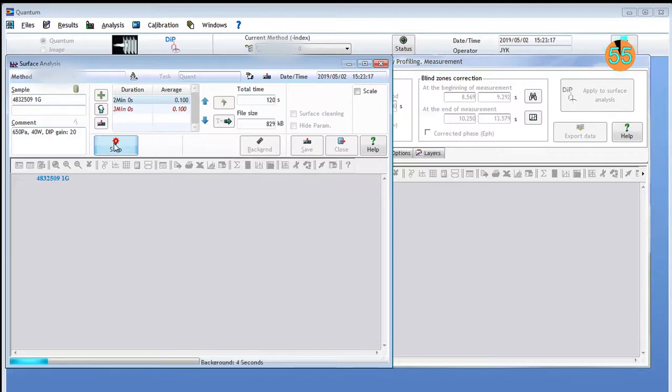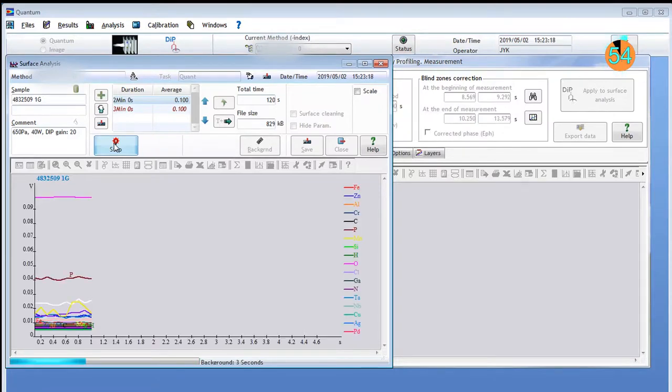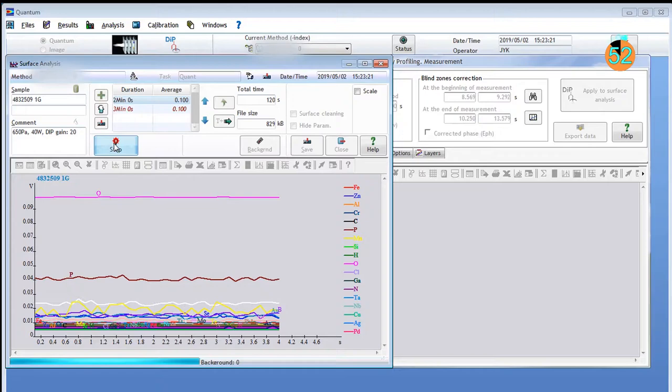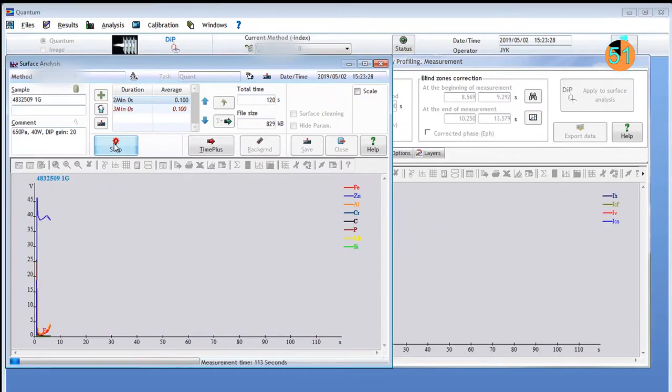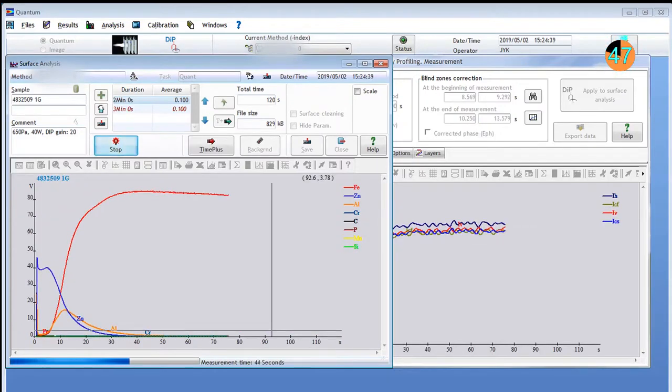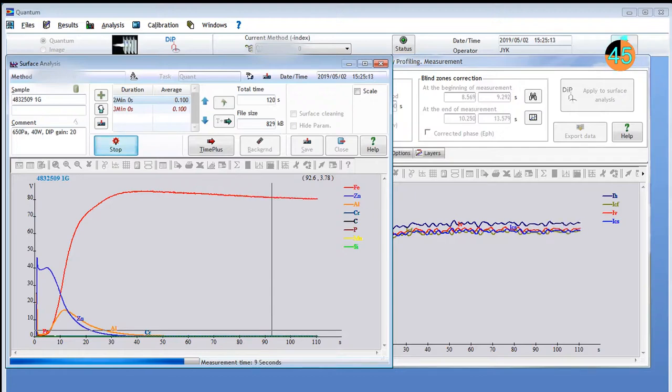Quantum provides fully automated acquisition with real-time display of the signal as a function of time. DIP performs depth measurements in real-time along with the signal acquisition.